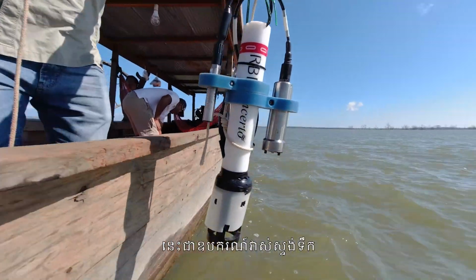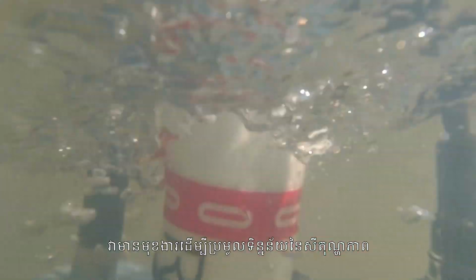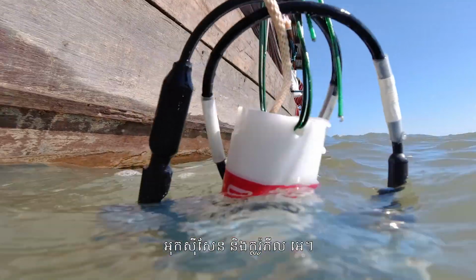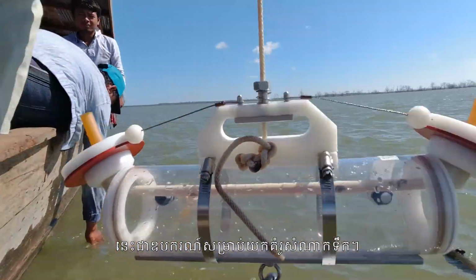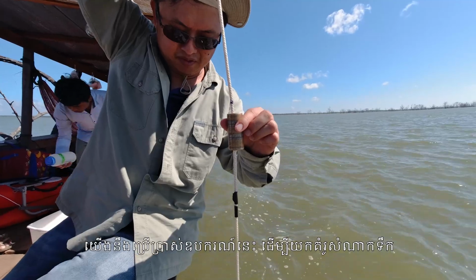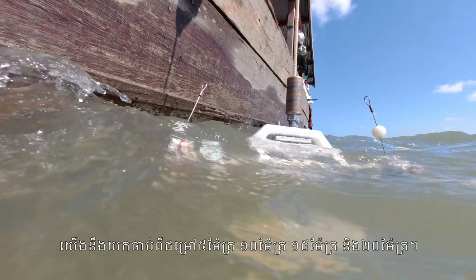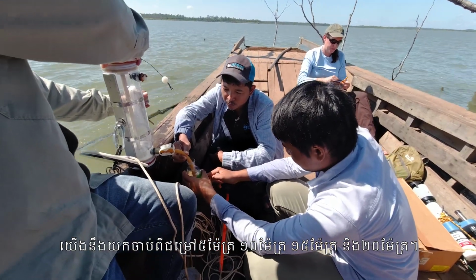This is the water profiler. It basically collects data on temperature, oxygen, and chlorophyll A. Oh, almost 20 meters. This is a water sampler, and we use this to take samples of water from different depths of the reservoir. So we will sample at 5 meter, 10 meter, 15 meter, and 20 meter depth.